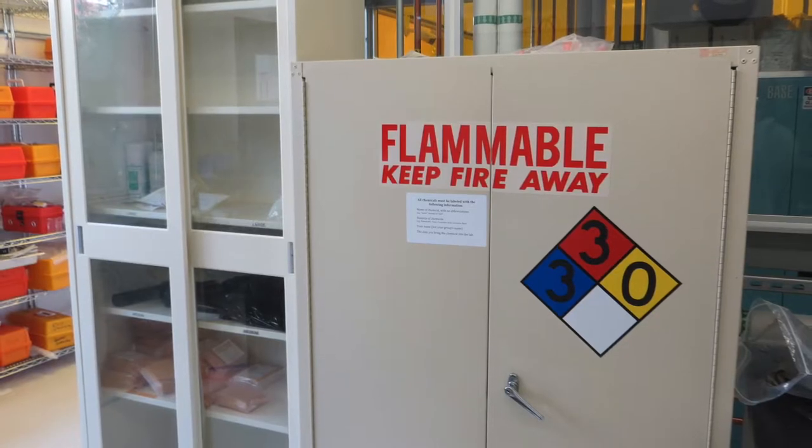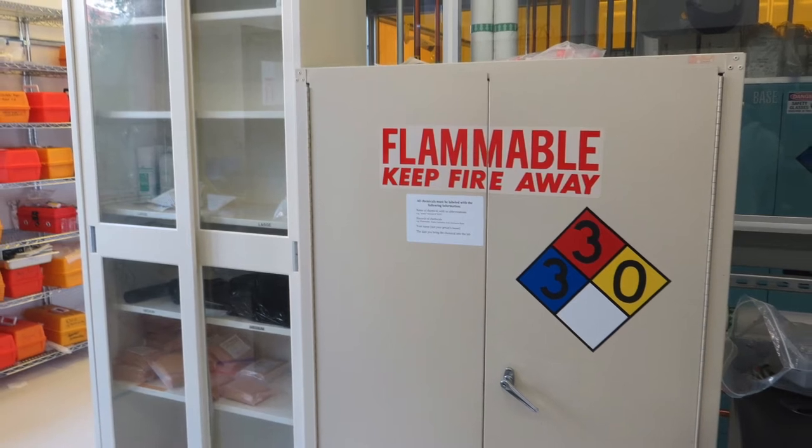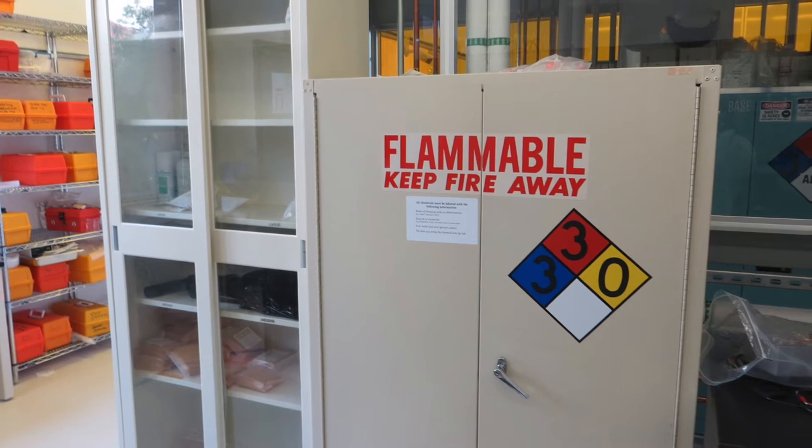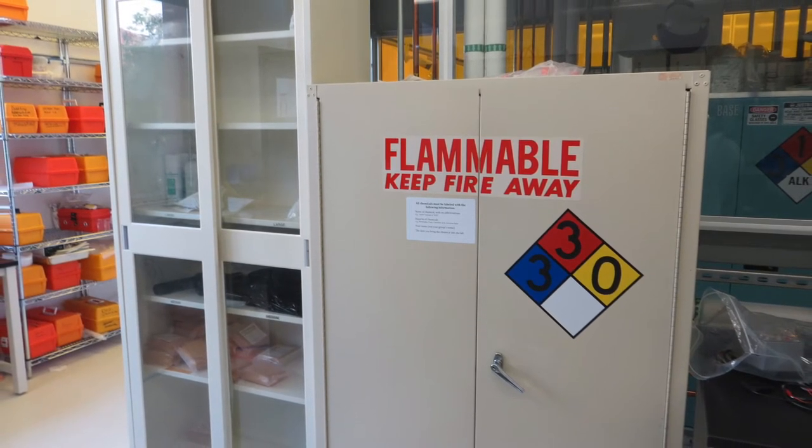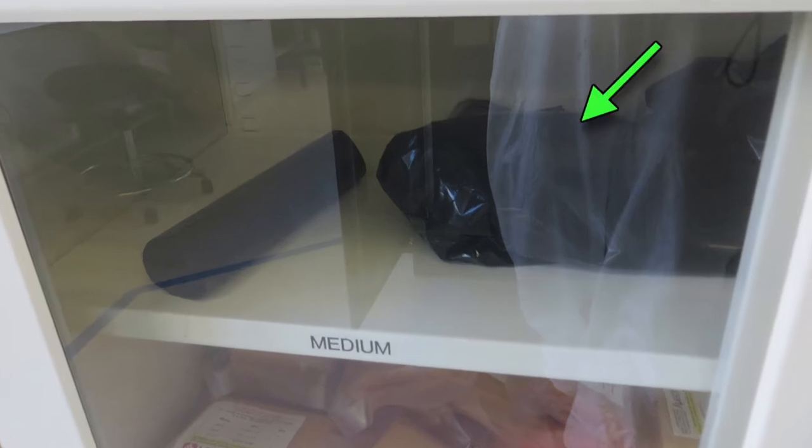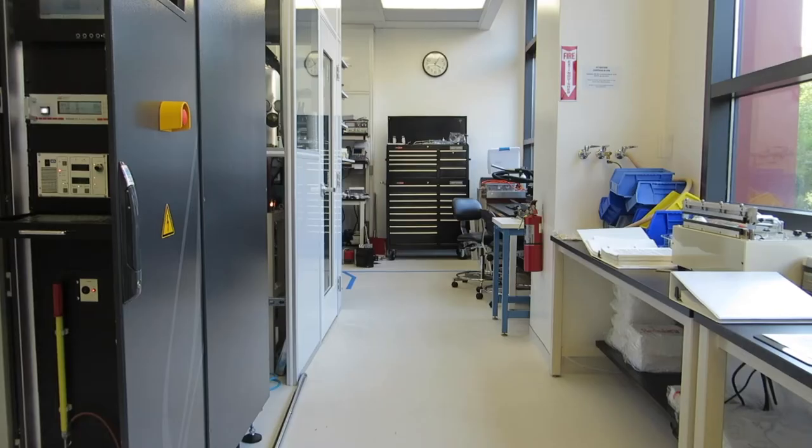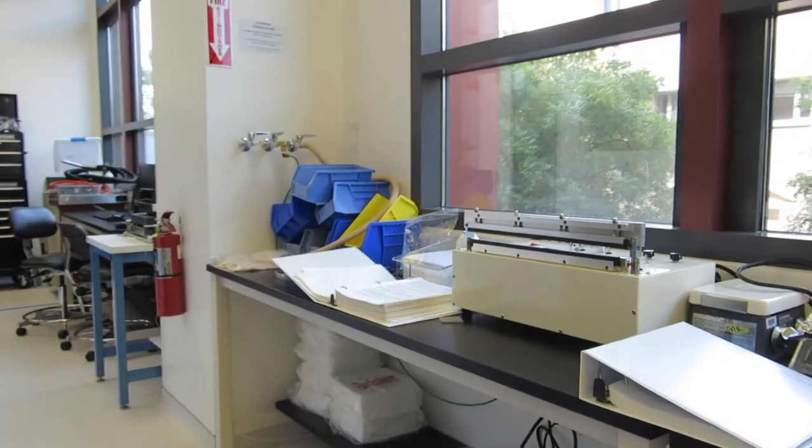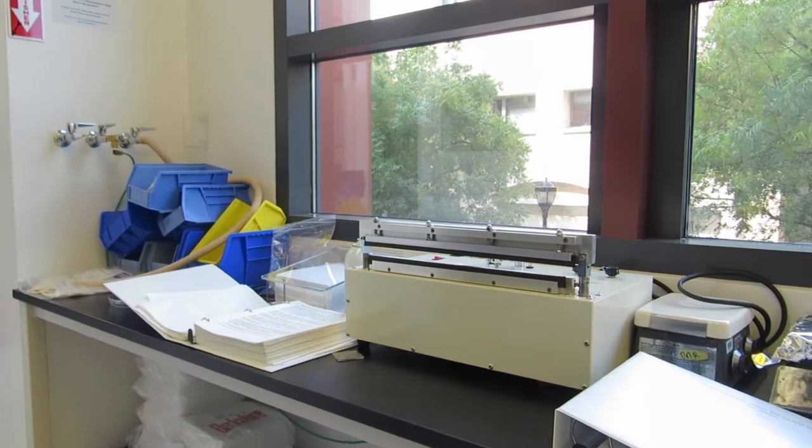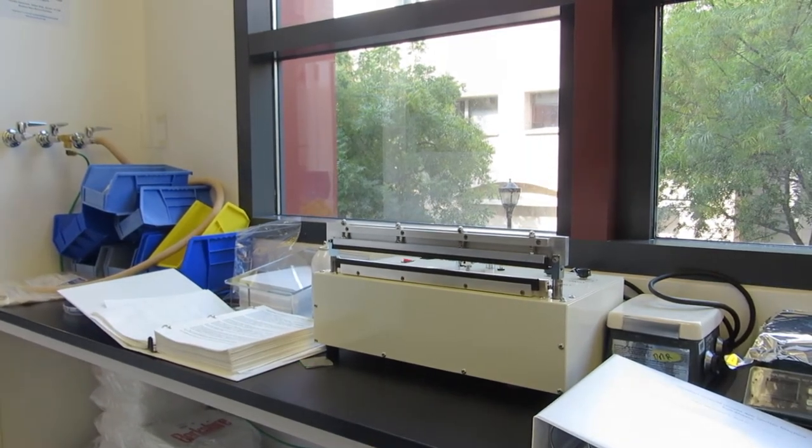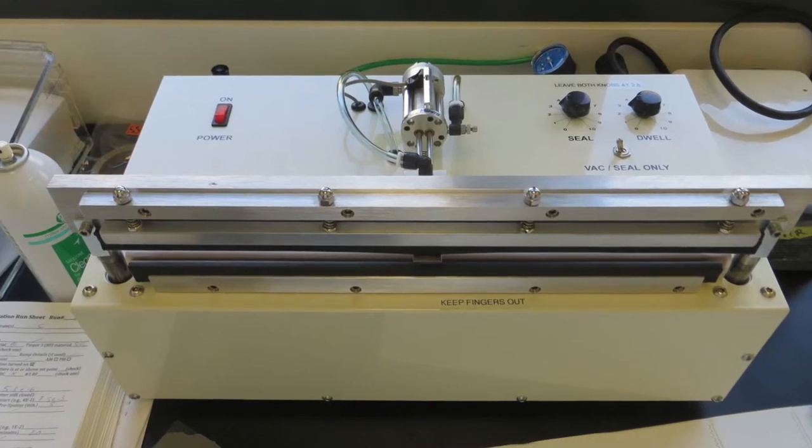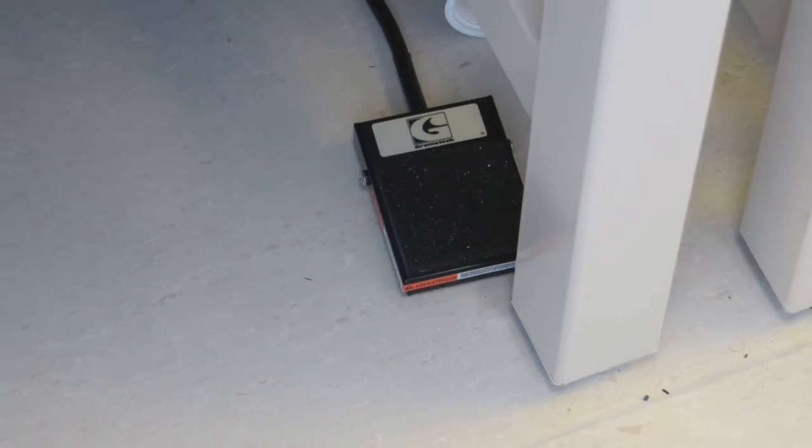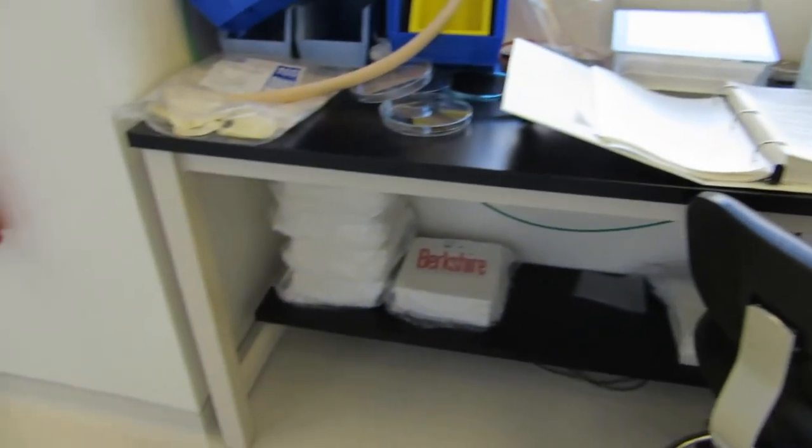Facing the sputter station is this cabinet where we store miscellaneous flammable liquids and solvents. But the more commonly used solvents are stored in a larger cabinet in a service chase behind the solvent bench. If you fill up a waste basket, here is where the spare trash can liners are located. If you run out of cleanroom wipers in one of the dispensers, this is where the packs of wipers are stored.